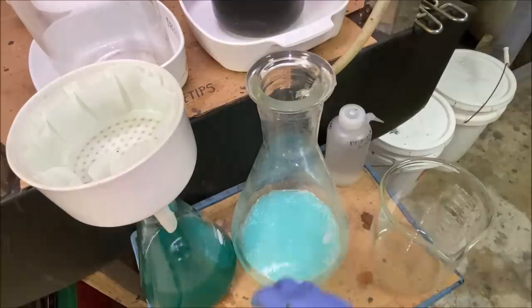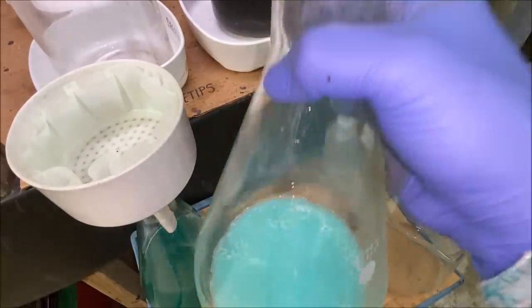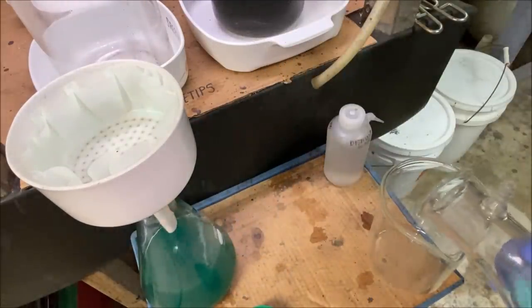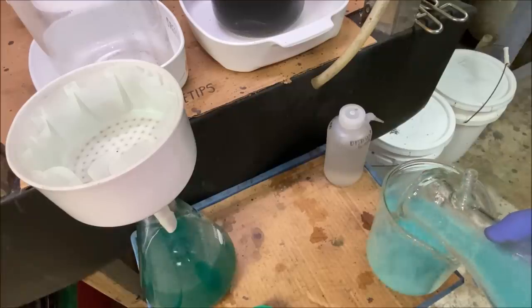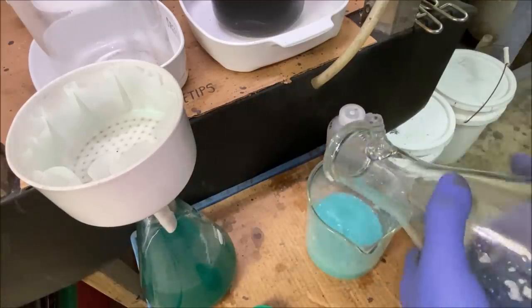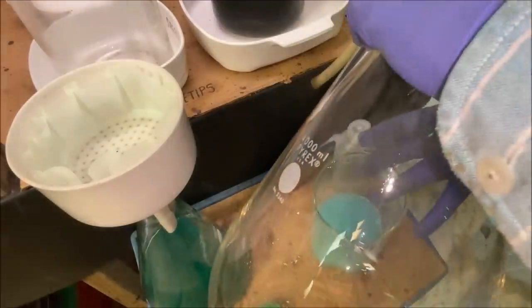So what we'll do is we'll pour this solution that's got some hydrochloric acid into this beaker. We'll save it. It's going to have a bunch of silver chloride in it. I'm going to go in and wash this flask out.